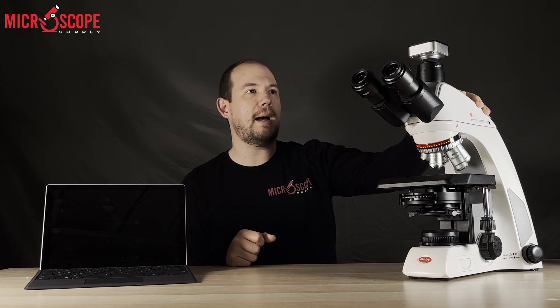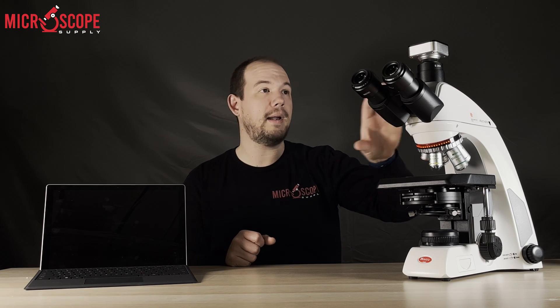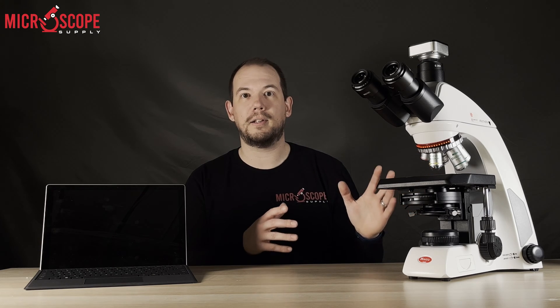Starting from the top, just like most microscopes, you have the option for different viewing heads. The Pantera is available with a trinocular or a binocular viewing head. Of course, if you want to add a camera, the trinocular is what you want to go with. They do have C-mounts for just about any microscopy camera on the market, as well as a photo tube with eyepiece options for attaching your own consumer grade or DSLR camera.